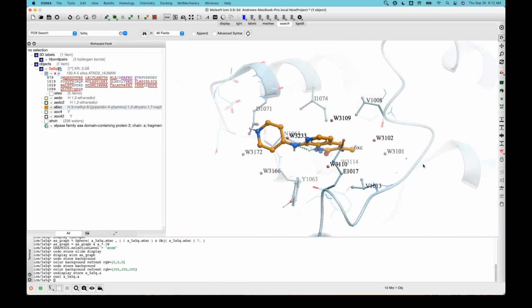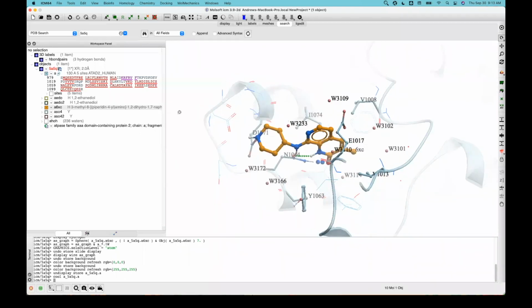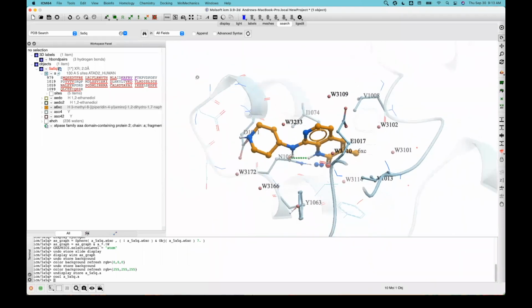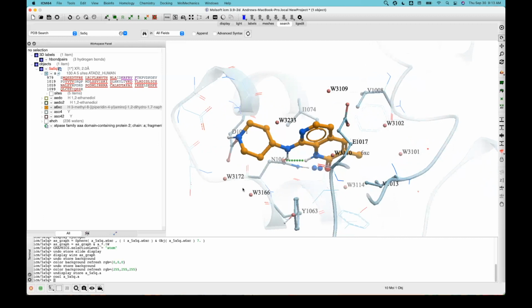There are lots of webinars online about how to manipulate structures in ICM, but generally, the tools that I'm using for rotation are here by default. Certain parts of the screen are devoted to different actions. So for zoom, you can zoom in or use your middle mouse button.